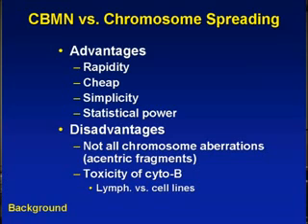It doesn't require any special training to do this kind of measurement. Most importantly, the statistical power. You can score hundreds of micronuclei versus most of the cases you can only get few chromosome spreading, and the result from the few chromosome spreading sometimes is not statistically significant to tell the differences, especially you are looking for minor changes.